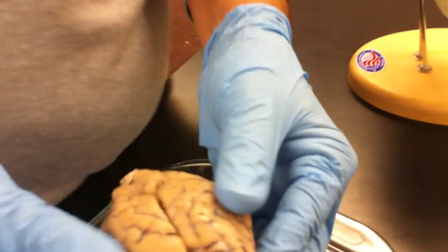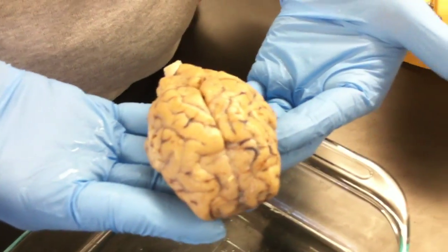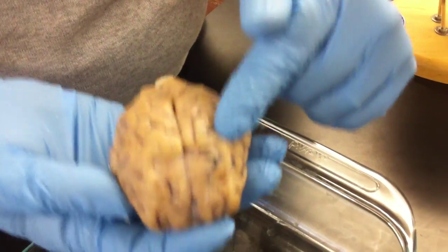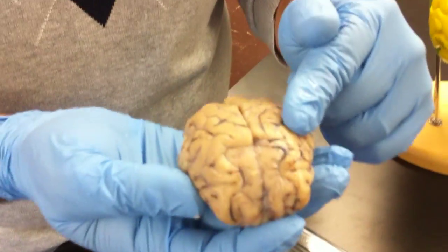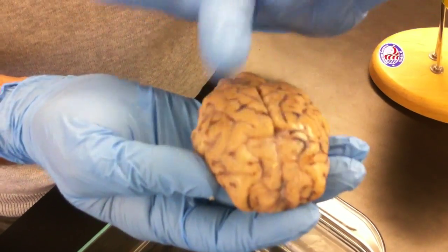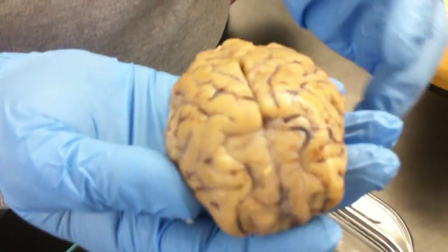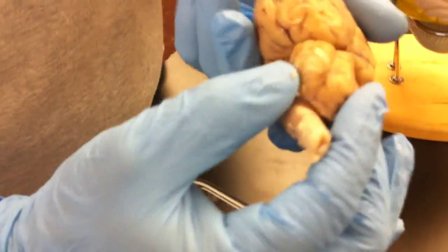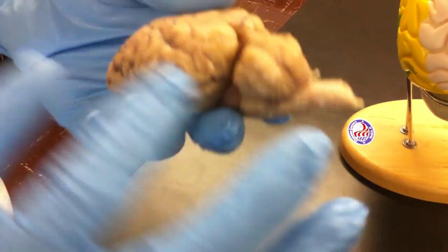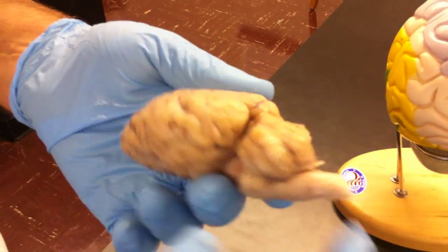The other thing you should notice about the cerebrum is that it's divided into two hemispheres. This is the left hemisphere, with the sheep looking at you from this angle. So that's the left hemisphere, and this is the right hemisphere from the sheep side. Behind the cerebrum is the cerebellum, and you see it has little ridges on it, but they're quite different from the nature of the ones on the cerebrum.